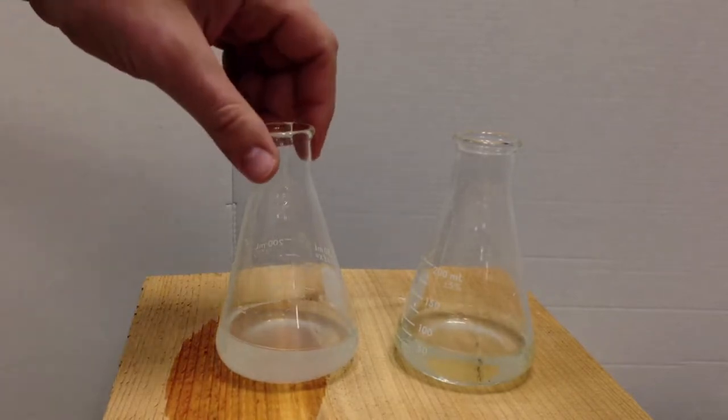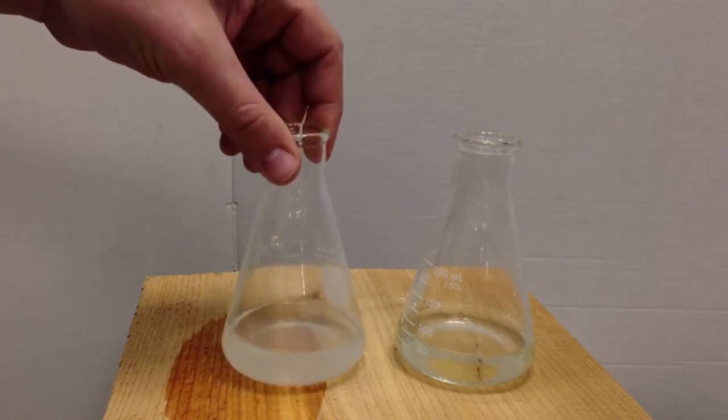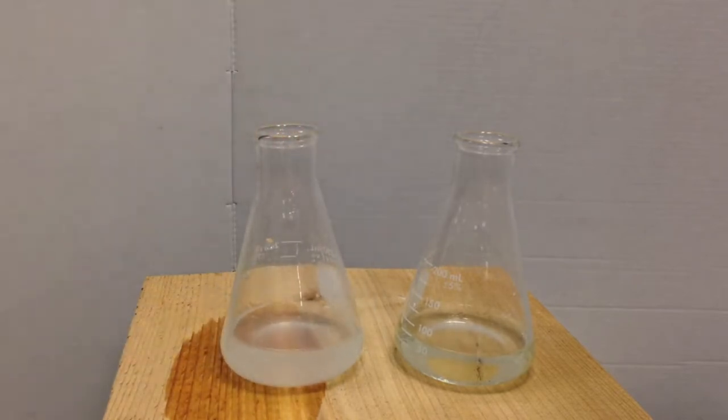There's some exceptions with those, and we're going to see that one right here. So I'm going to pour these together and take two aqueous solutions and see if a precipitate results. Now, precipitate is when a solid comes out of the solution because we're going to do a double replacement, or something called a metathesis reaction.